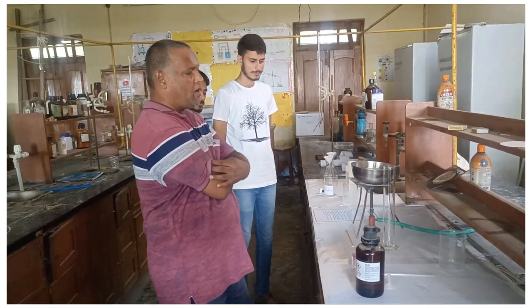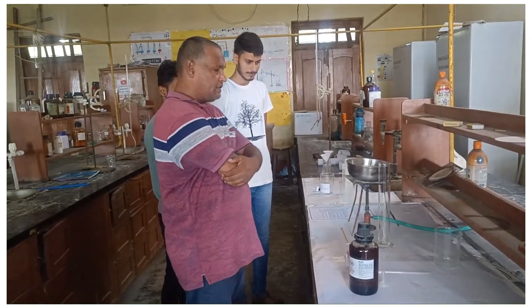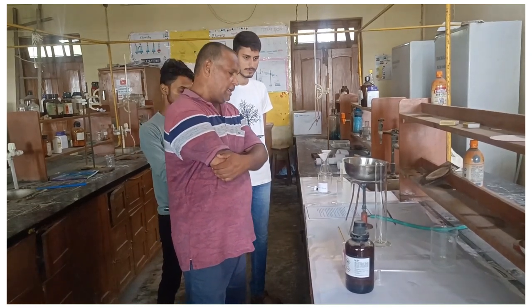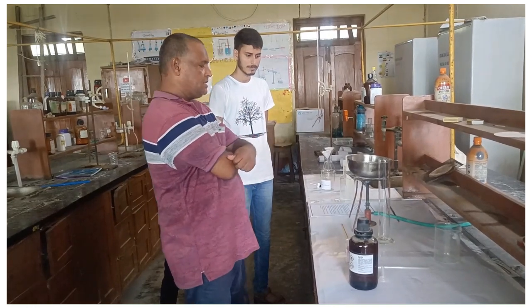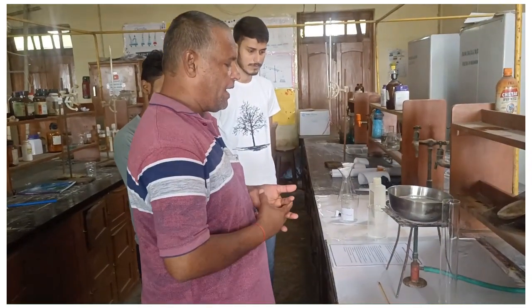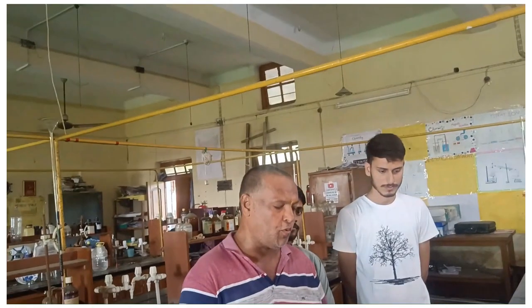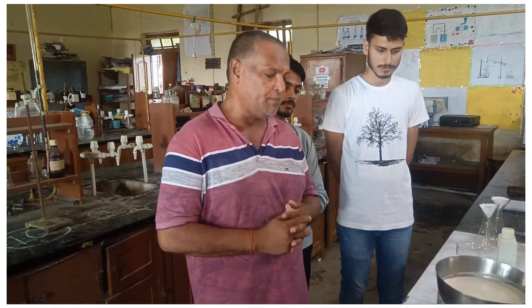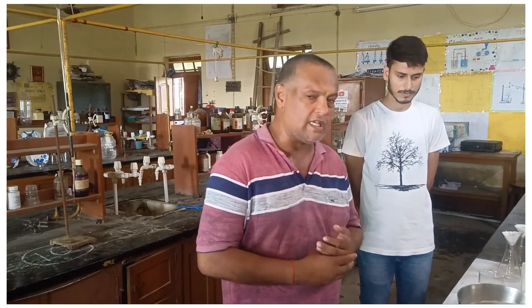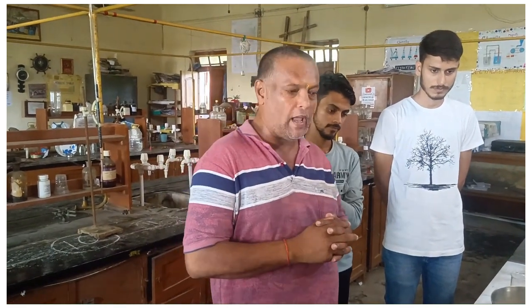We will perform an experiment in organic chemistry number 24. This experiment is very important and the topic is isolation of casein, that is protein, from milk. What is the principle regarding this? Casein is soluble at the normal pH of milk. When acetic acid is added to milk, the pH of milk reduces. When the pH reaches 4.6, casein starts precipitating because the isoelectric point of casein is 4.6. And at this pH, casein is insoluble in milk and precipitates out. So for this, what are the things we have to collect?